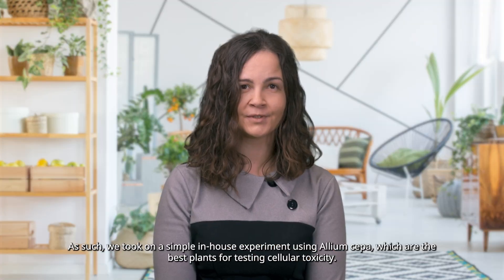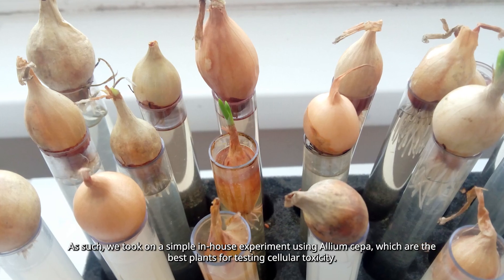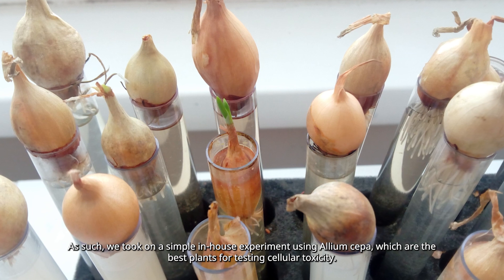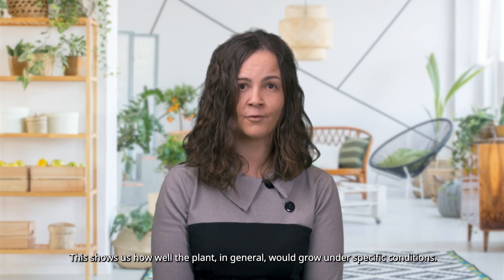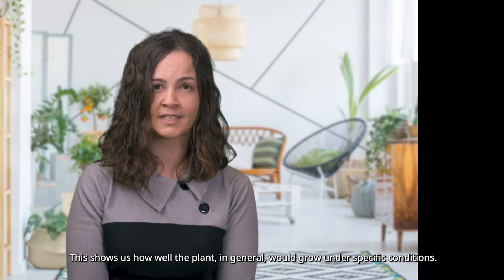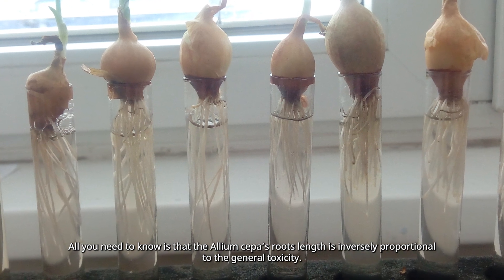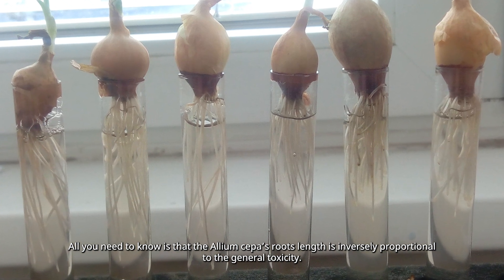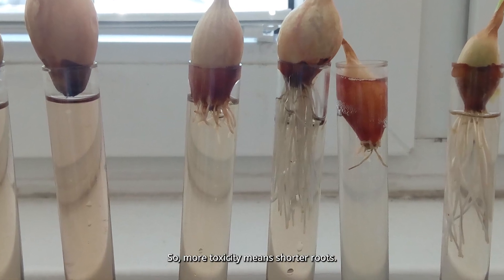As such, we took on a simple in-house experiment using Allium Cepa, which are the best plants for testing cellular toxicity. This shows us how well the plant, in general, would grow under specific conditions. All you need to know is that Allium Cepa's root length is inversely proportional to the general toxicity — so more toxicity means shorter roots.